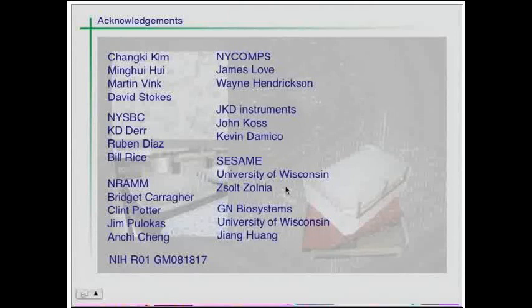To evaluate everything, for Leginon to find out the exact regions of the grid where it wants to take images, and then to take images and all that, it takes about 40 minutes. Yeah, the evaluation by the person typically takes just an hour. It's the acquisition time and other things that matter.